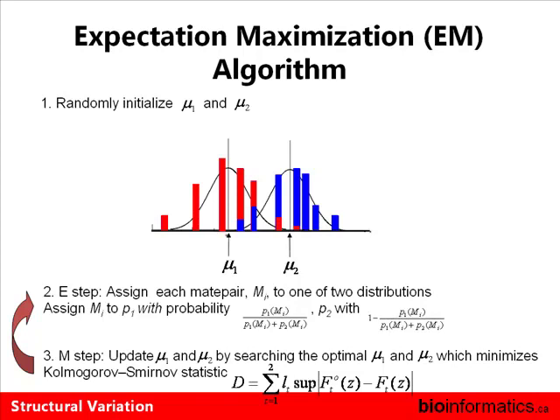Well, no. The distribution shape is known. This is the distribution of the size of the insert. This is the empirical observed distribution of the insert size. Sorry? Is the sampling with or without replacement? We assume that the sampling is with replacement, because we sort of think that there is an infinite supply of DNA. This is not completely true.